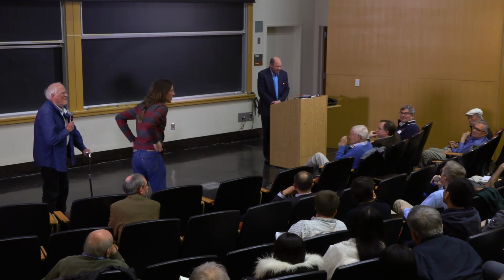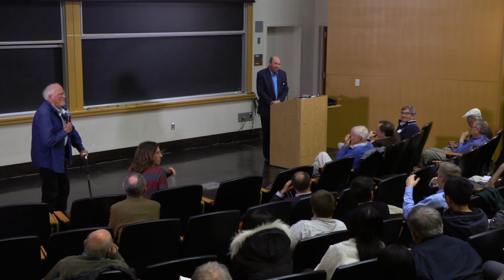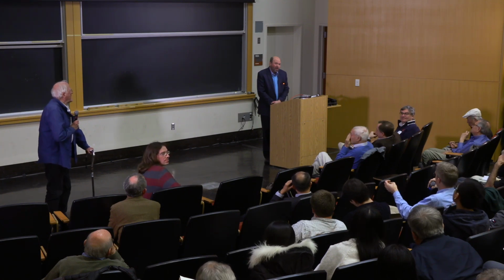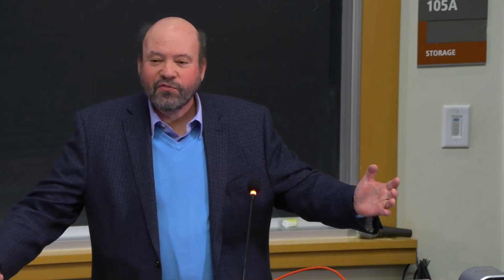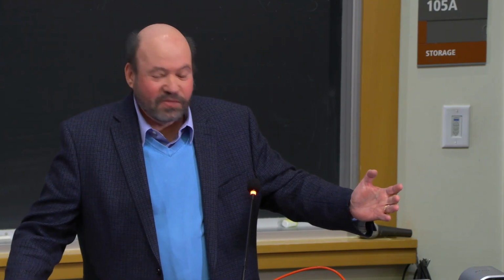Sorry if I missed it. In the end, what happened to the idea of decelerating the electrons? Was it just not worth the effort because the anticipated gains wouldn't get us far enough, or is there some fundamental reason it shouldn't be done? There's nothing fundamental. It's technically challenging. Takes a big volume of space. You unfortunately have to float your camera at several 100,000 volts, so that's a bit of a challenge.